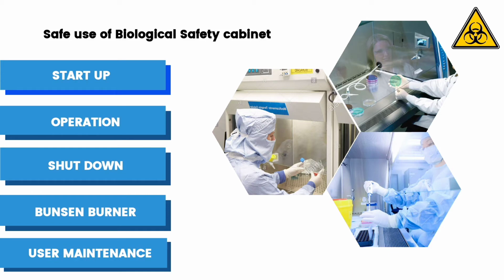Person should wear gloves, lab gowns for their protection. Needed materials must be kept inside the cabinet before starting the work. Ensure the drain valve is closed before starting with the work. Proper space must be provided for placing the equipment to avoid disturbances.